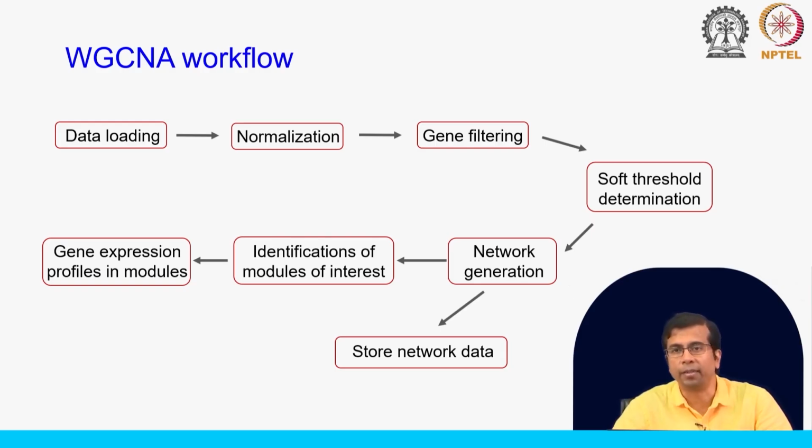Okay. But in this hands-on class, we will use a very simple filtering. We will not go into the differential expression analysis itself, because that will take a lot of time, and of course we will not be able to complete that within a short period. So, we will use a very simple filter for the genes that show the highest variation after we have done the variance stabilization technique. Those will be the genes of interest.